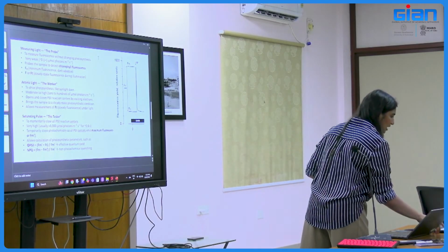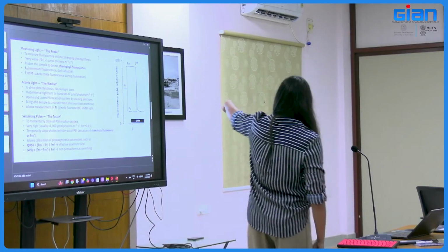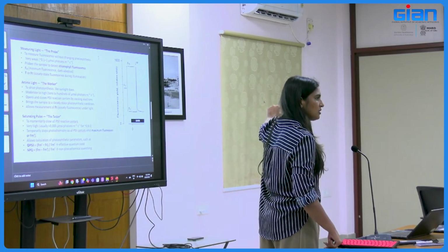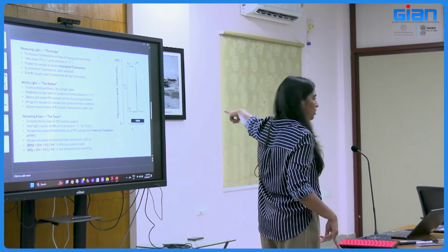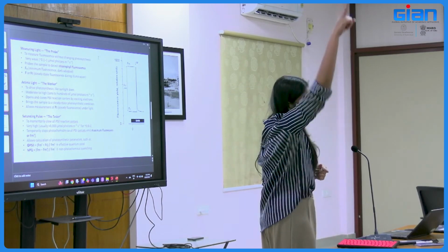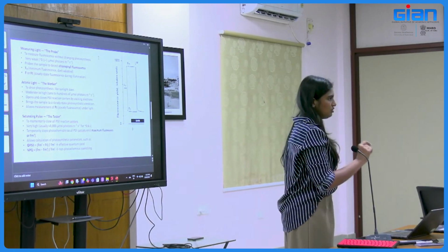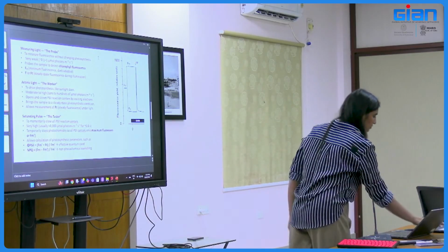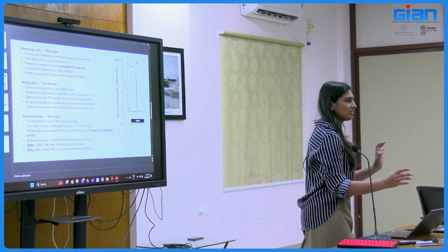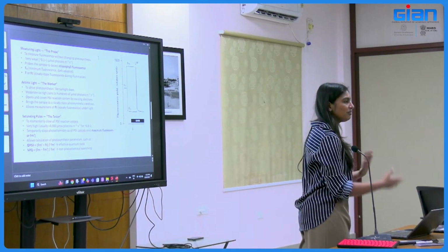You will see that. And you see, I was talking about the saturation pulse. The graph itself says F naught, you are now familiar with it, I guess. It is the initial fluorescence. In a measuring light, the F naught signal will be there. But when you suddenly give a saturation pulse, you get the maximum peak, and that will be the maximum fluorescence you get from PS2. So are these light components clear, or do you have any doubt, you can ask. Anything needs to be repeated? Okay.